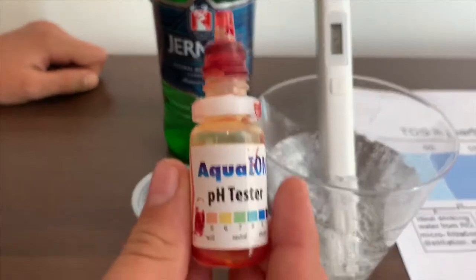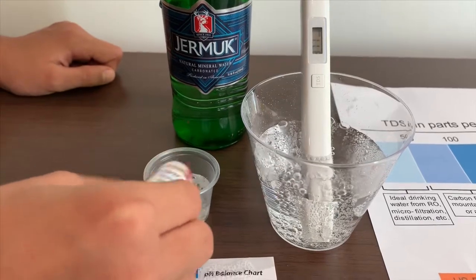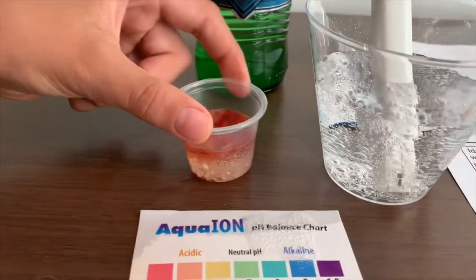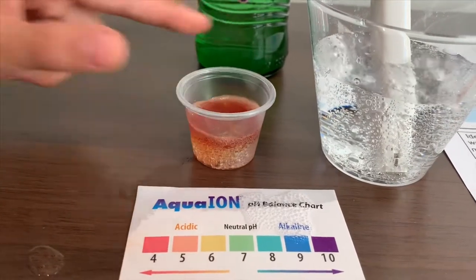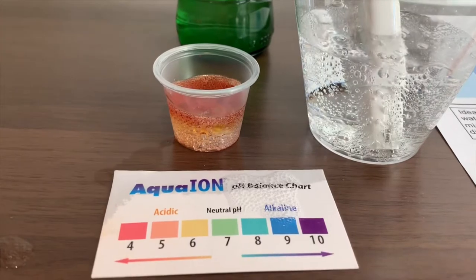Now let's test the pH level. Two drops alone. It is close to the earth — I'm going to say 5.5.